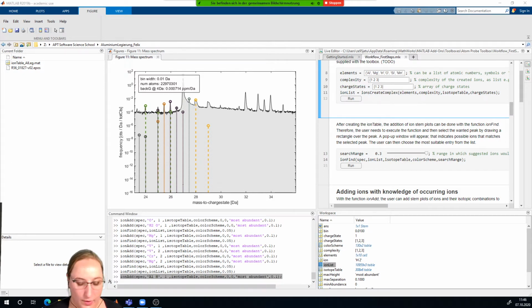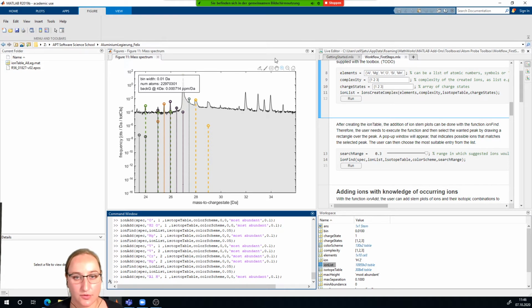And now when you have this view and you don't want to have it like this, I prefer to not do it up here with the hand or something else with the slider like Peter showed you. My preferred way is to just type in axis, and then you go for the x coordinates.